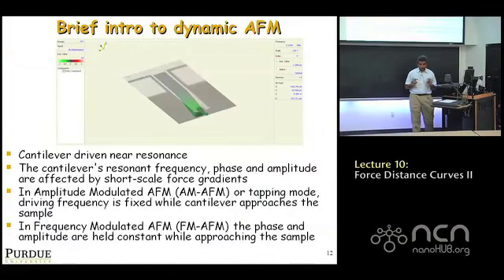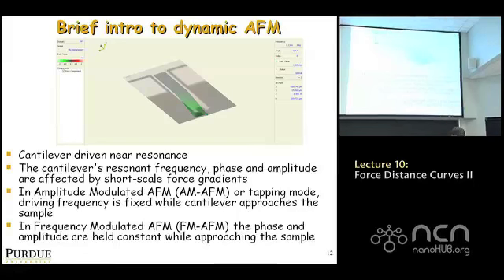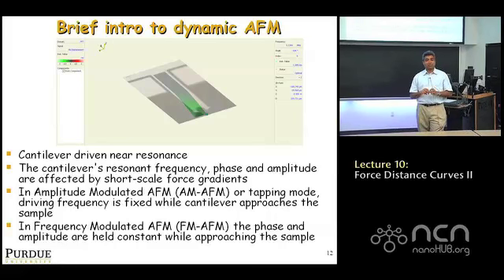Okay, so we're going to have about 3 lectures dealing with dynamic AFM, but for now, this is just a brief intro, and we need to do this before the next class, which is on calibration methods, because many calibration methods use dynamic properties of cantilevers. But basically, you go back to a lecture 2 lectures ago where we talked about how you have a cantilever, you apply a point force, the cantilever bends, and the equation of the bent curve is, anyone remember?